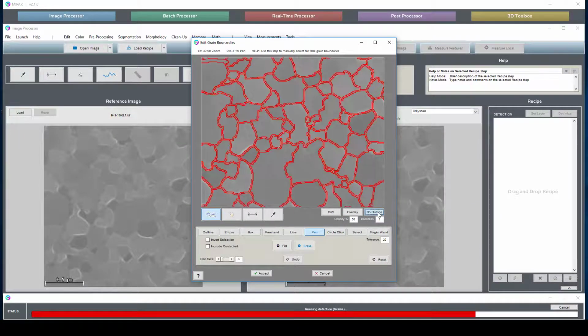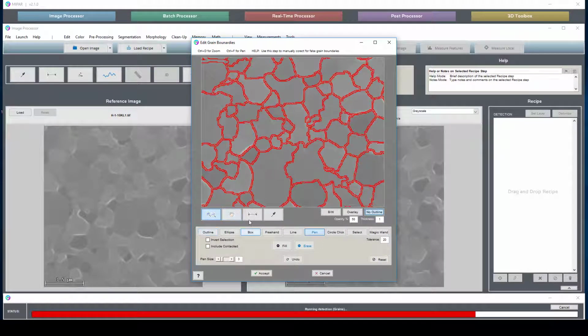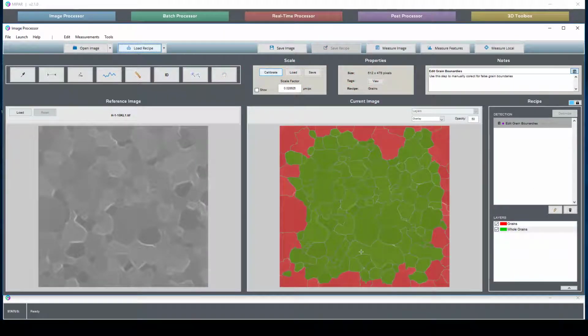Or if you see that there's a separation where there shouldn't be a separation, you can also correct for that by simply, for example, say I didn't want this separation here. If I just cross out that separation line, MyPar is able to understand that, and it's able to combine those two features. So once you've made these corrections, again, that will happen on load.